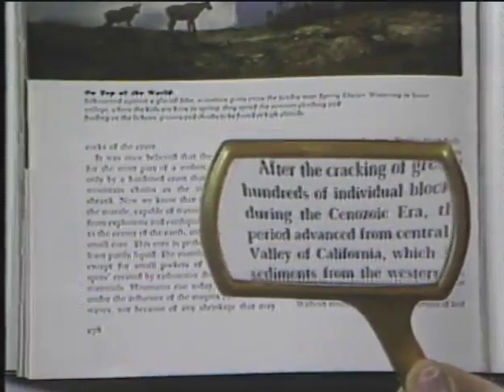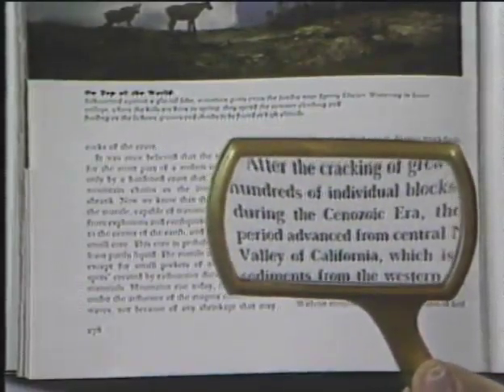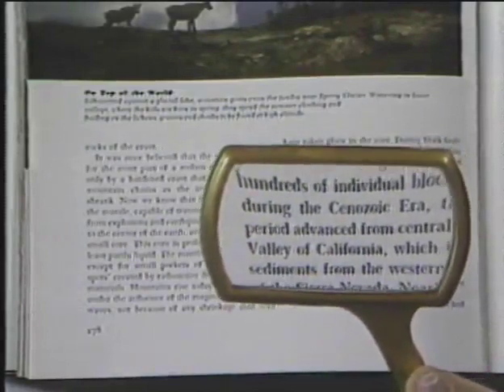Magnification is the act of expanding something in apparent size. It is represented by the ratio of image size to object size. An example of a simple magnifying device is a magnifying glass containing a single lens.